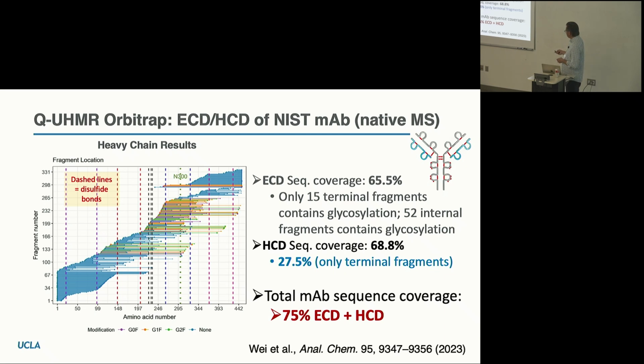The last paper we published, just earlier this year, does middle-down mass spectrometry. So if you're hip to these different techniques that top-down people use, you cut the antibody at the hinge region using the FabRICATOR enzyme. Now you look at the 20 kilodalton pieces, and you get about 99% sequence coverage just by using ECD. So cutting the protein down into smaller pieces helps, but you can get quite a large amount of sequence directly from this 150 kilodalton protein.